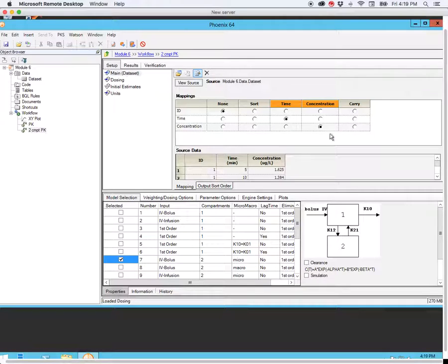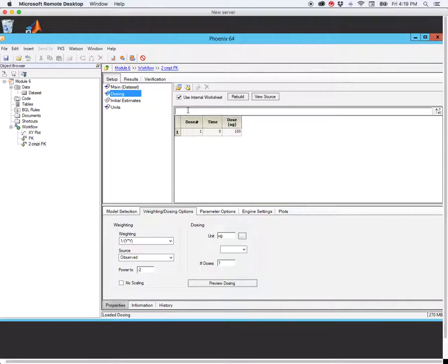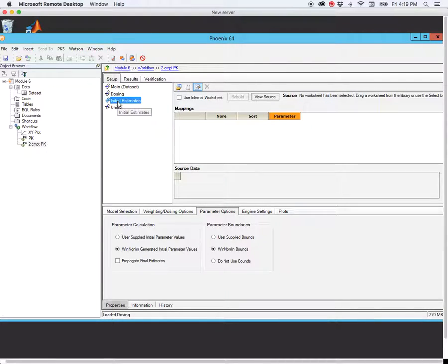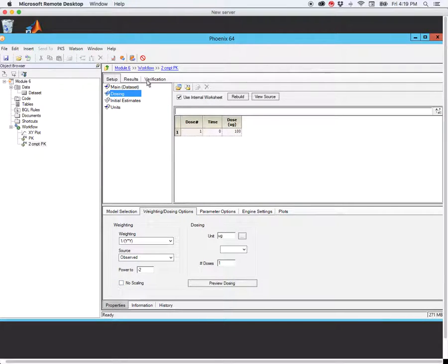We've mapped time and concentration. We can sort by ID — we need to do this if we have more than one animal's data. We only have one, but let's sort anyway so we don't forget if we have more than one animal. Once again, we need to enter our dosing — our dosing has not changed. We'll let the program select the initial estimates for us again. The weighting scheme is the same again. And now we're ready to run.